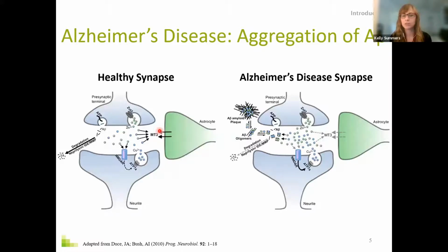There's minimal upstream in terms of focusing optics, so we can have that larger, blurred beam, which works really well for this type of sample.